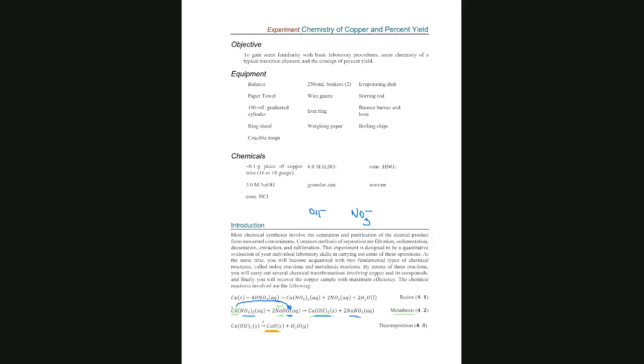Any remaining OH ions? Yes, that is true. But we have excess of that, yes. But what happens? The OH combined with the copper.